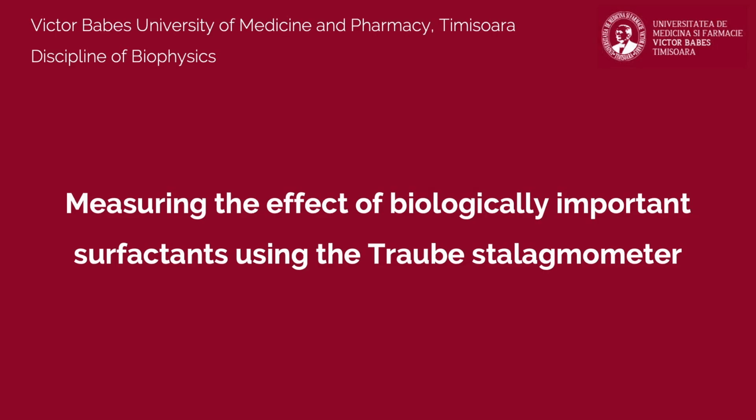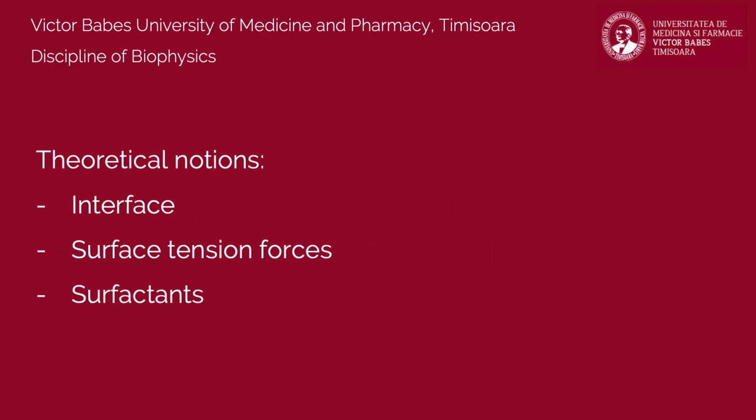Hello! In this work, you will determine the values of surface tension coefficients for some solutions and will observe the effect of surfactants on those. For starting, let's introduce some useful theoretical notions.